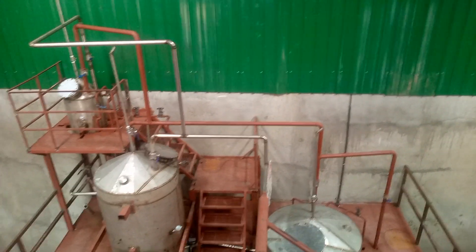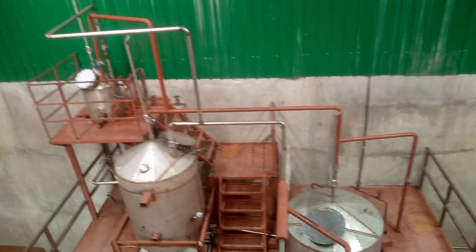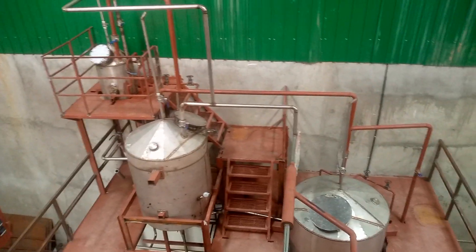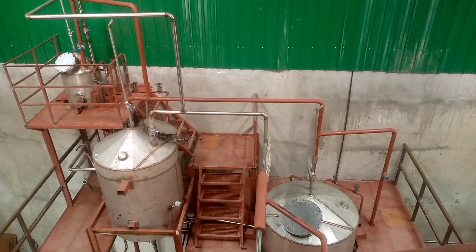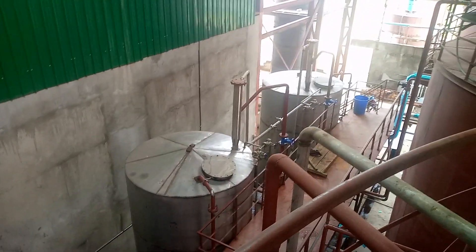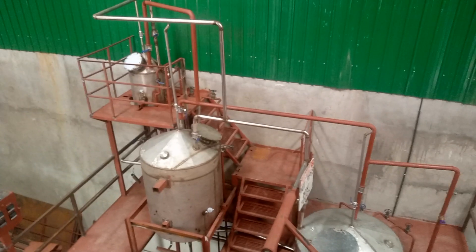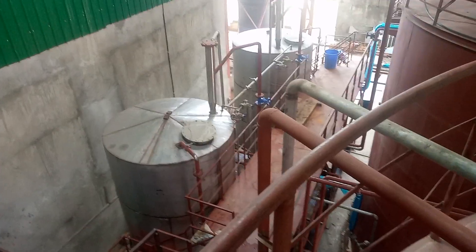That is the culture system process for when you're using slant, mostly, so that you do away with dry yeast. This helps you improve your yield recovery pattern by increasing it to around 250 to 260 or 270 liters per ton. Over there we have our pre-fermentation section — here we have a silver one, culture vessel one, culture vessel two, and culture vessel three.